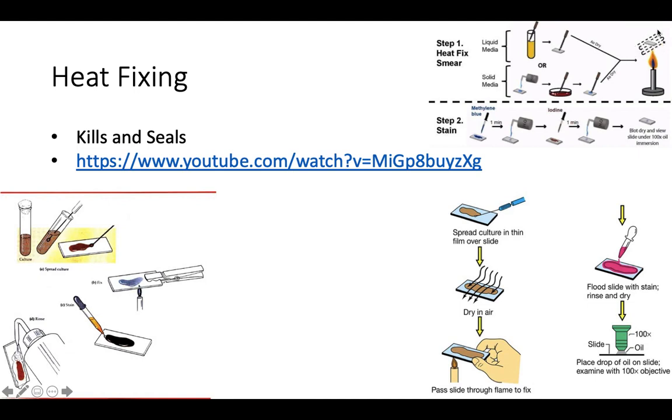The water is used to spread them around on the slide so they don't just make a big blob in the middle. You get a scoop of bacteria off your plate, you put it in the middle of a slide, and it's just going to be a good big blob. So you don't want to do that. So you put it in a little water droplet and spread it around and smear it around a little bit. And that's what they're called, smears, by the way.